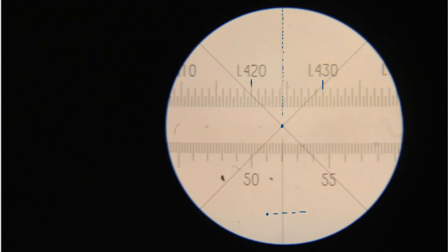So now we've got to think about divisions. Well, that means that this is 421, 422, 423, 424, 425, smack dab in the middle. It's the taller line. 426, 427, 428, 429, and 430. That is how the divisions are made in the refractive index that we have. However, you also see these short little tick marks. These are kind of halves.